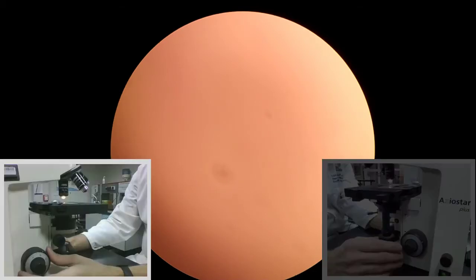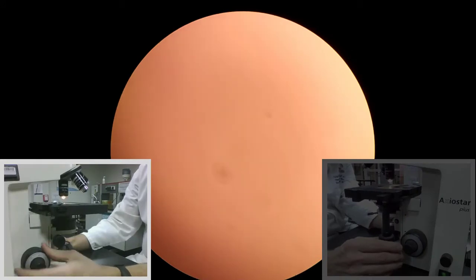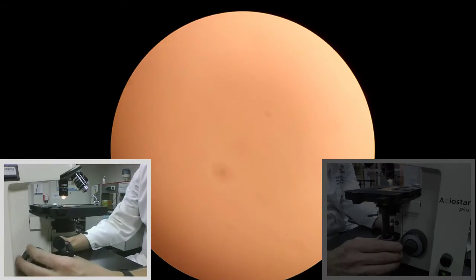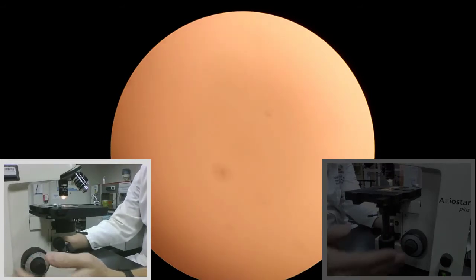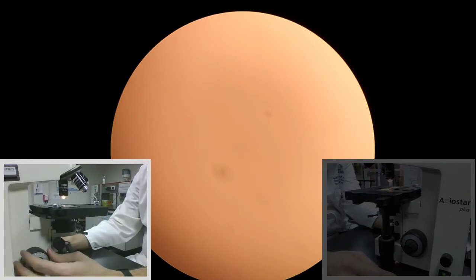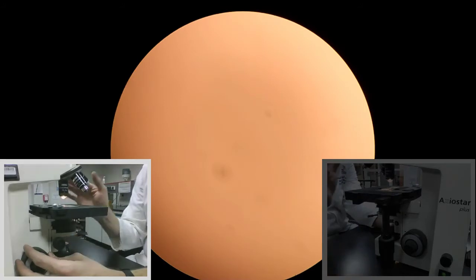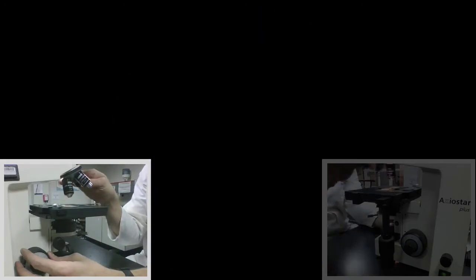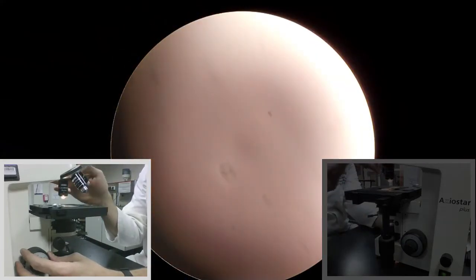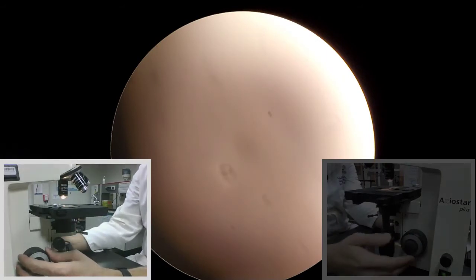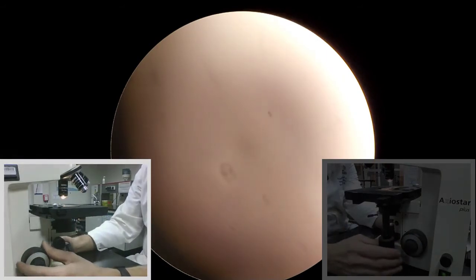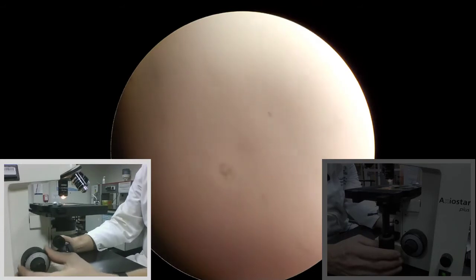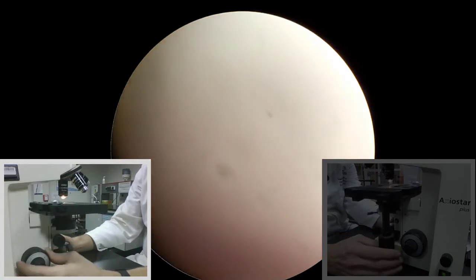The next thing I need to do is get this into focus. If I'm starting off with my stage pretty low, that can be a fairly common problem because gravity tends to pull stages down. So one of the things you want to do is bring your stage all the way up. You want to be using the lowest possible objective lens — in my case I only have a 10x lens, so I'm going to leave the 10x lens in place and raise the stage using the coarse focus knob.